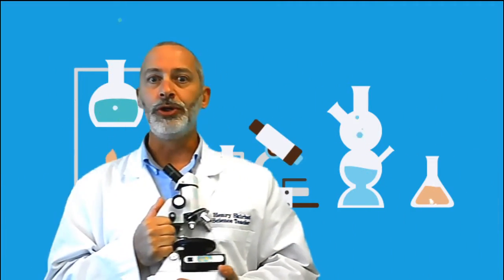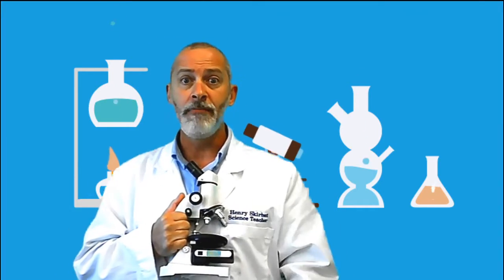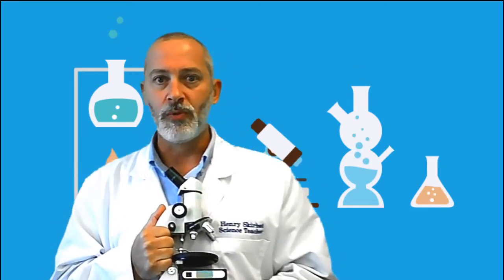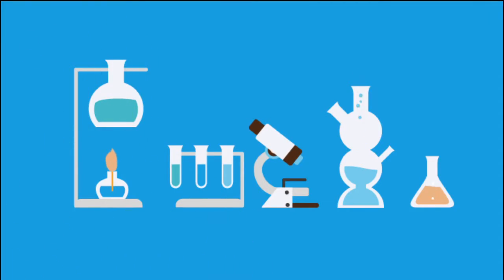That's how you carry a microscope. Remember your ABCs: arm, base, carry it close. That way you won't have any accidents. So make sure you remember your ABCs.